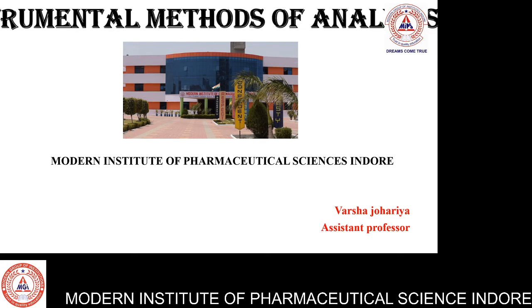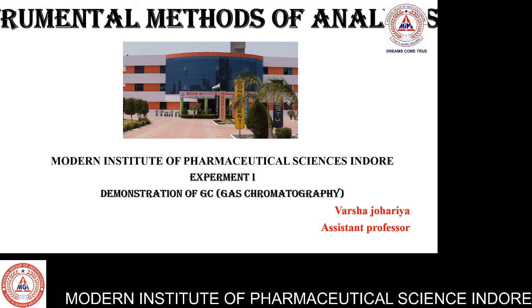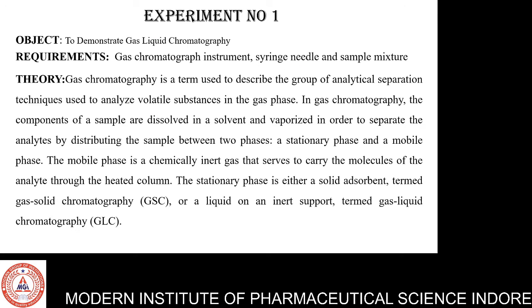Today, we are starting our practical series of instrumental method of analysis and experiment number first, demonstration of gas chromatography techniques, GC. So, experiment number first, and the object is to demonstrate gas liquid chromatography or gas chromatography. Our requirement is gas chromatograph instrument, syringe needle, and sample mixture.